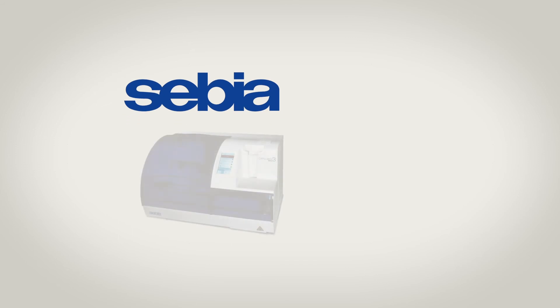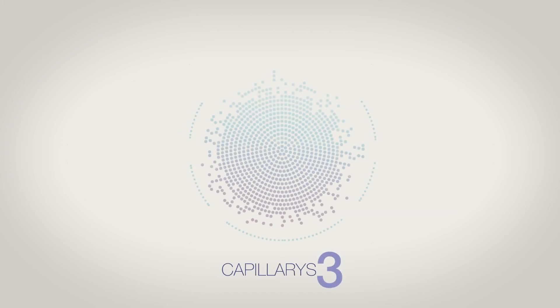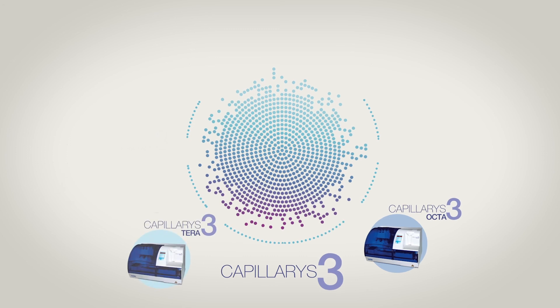Sebia, the global leader in capillary electrophoresis diagnostics, focusing on multiple myeloma, hemoglobinopathies, and diabetes diagnostics, providing maximum lab efficiency while increasing clinical value.